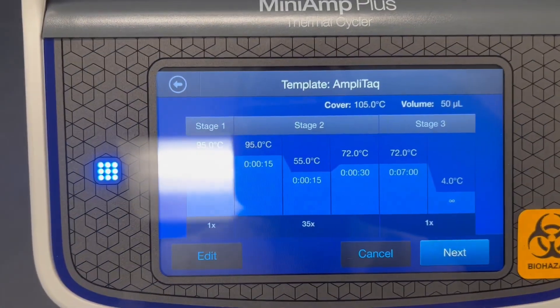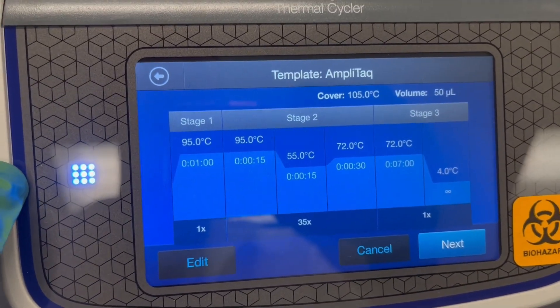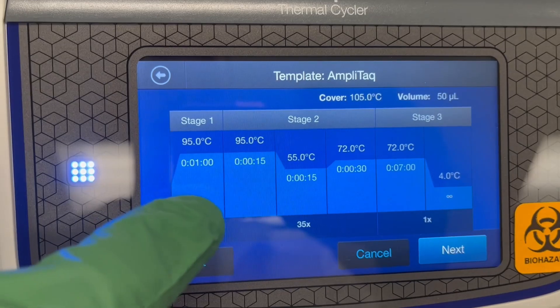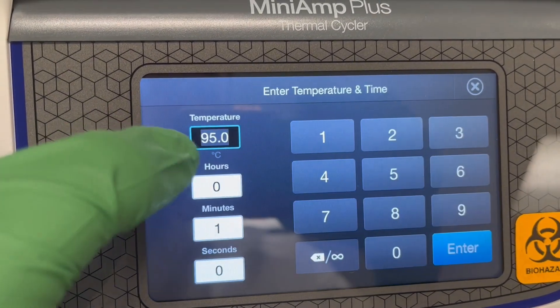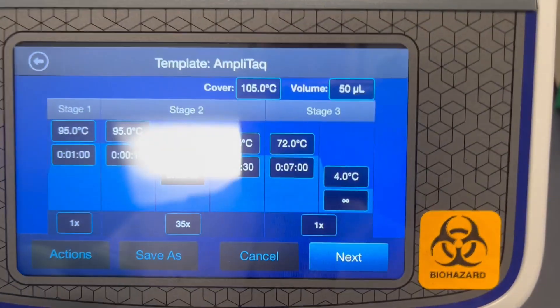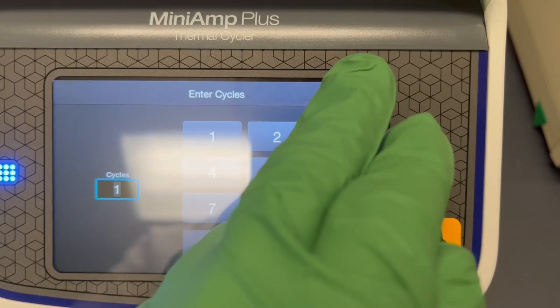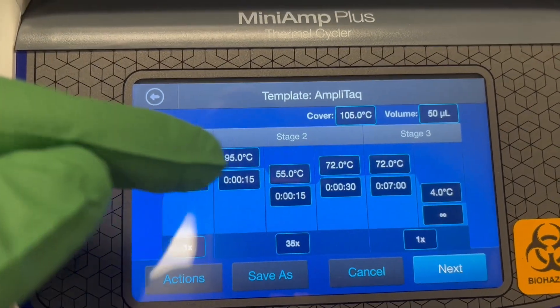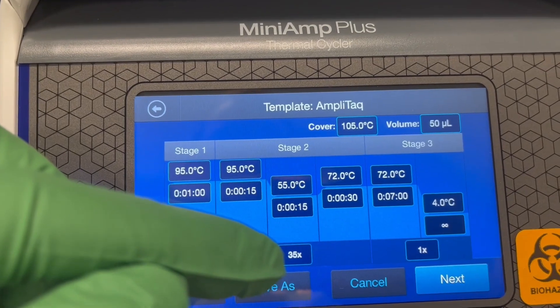Let's say we're using AmpliTaq. You can see that they already have some of the steps programmed in, and if you picked one of the blank templates it would look like this just with none of the values typed in. You can click on a stage or a step and click on each individual value to edit the temperature and time. You can also set how many times you want each stage to cycle — steps run within a stage, and the stage repeats by the number shown below.